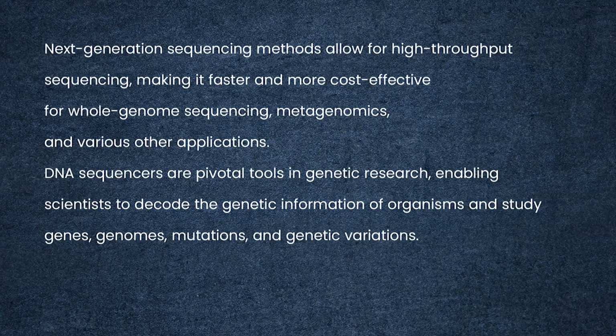Next generation sequencing methods allow for high throughput sequencing, making it faster and more cost effective for whole genome sequencing, metagenomics and various other applications. DNA sequencers are a pivotal tool in genetic research, enabling scientists to decode the genetic information of organisms and study genomes, mutations and genetic variations.